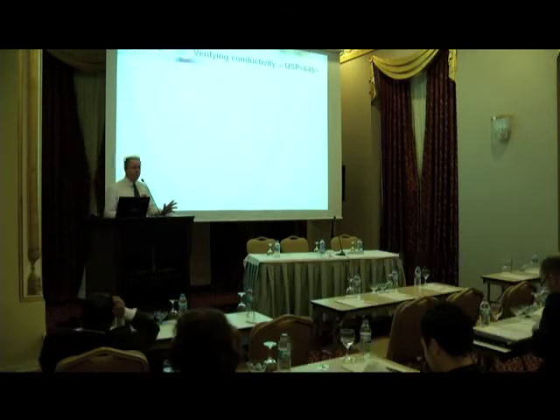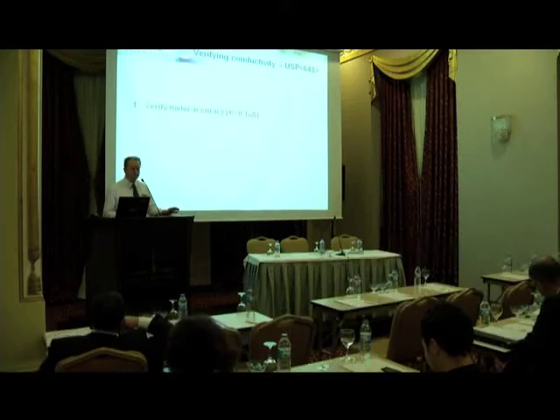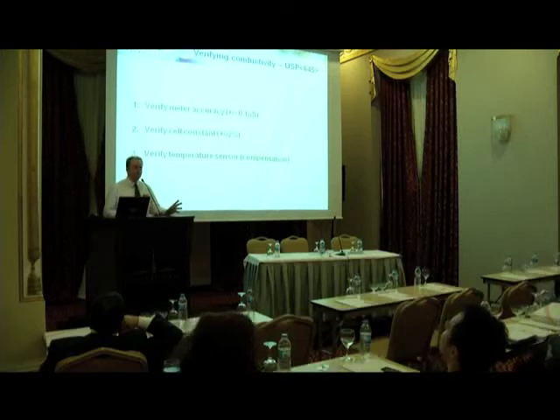As I mentioned, all these analyzers are conductivity analyzers, so we must verify the conductivity cell. We must check the electronic meter accuracy and also check the cell constant itself. And although I mentioned at the start that when we're measuring conductivity, we don't use temperature compensation, all TOC analyzers actually do.